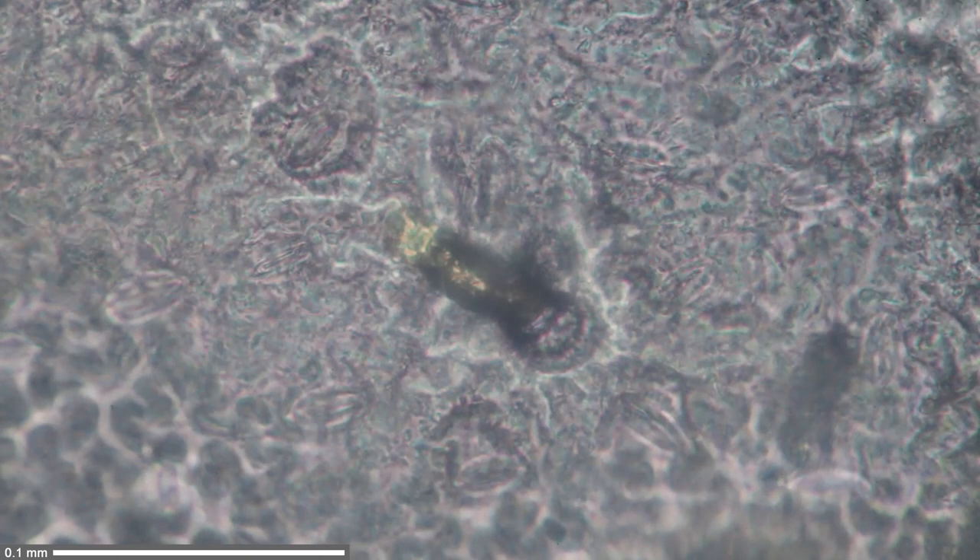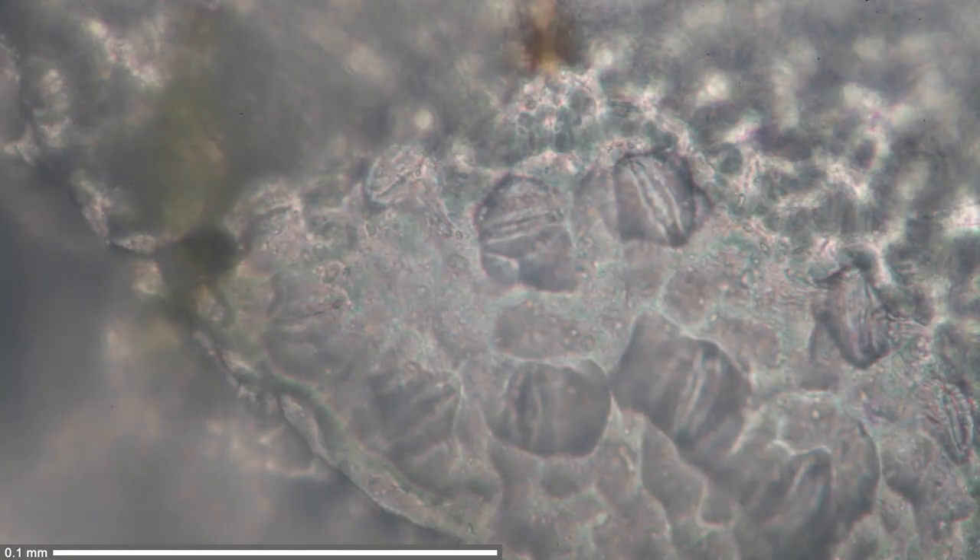At yet higher magnification — I think this is now the 40x objective — the resolution is already going lower because I'm still not using a cover glass or mounting medium, and these objectives expect both to work at optimum resolution. At the 60x magnifying objective, we can actually see the openings quite well, but it's quite blurry due to the lack of resolution. So yeah, it works — I'm quite happy and satisfied with that. It's a simple and easy project — and it was successful.